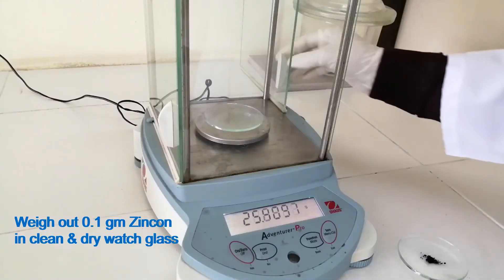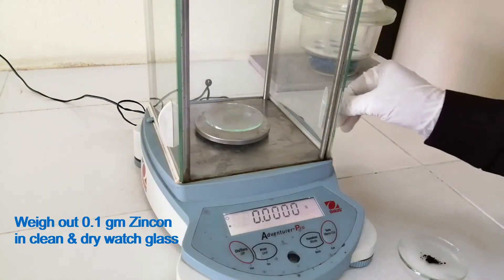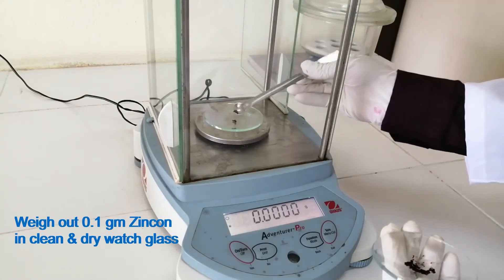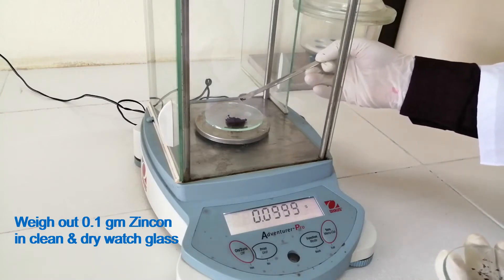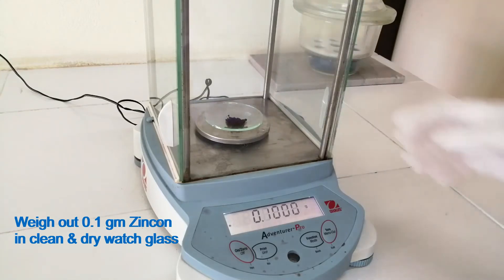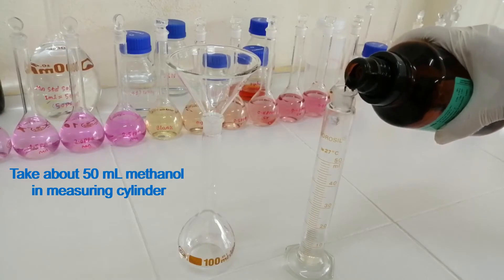Weigh out 0.1 gram Zincone in a clean and dry watch glass. Take about 50 ml methanol in a measuring cylinder.